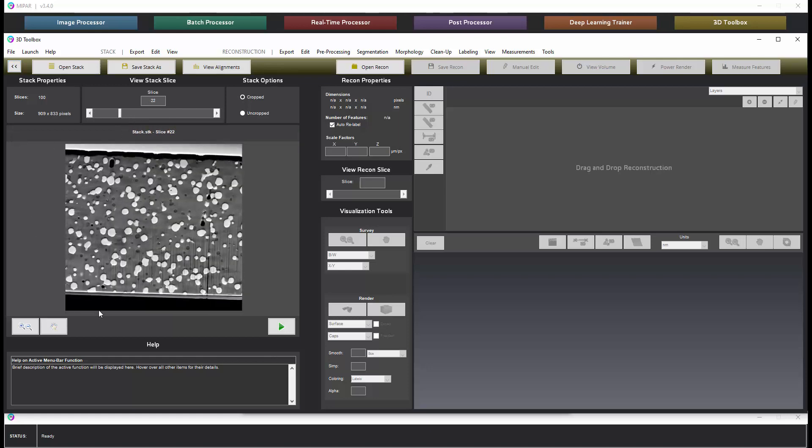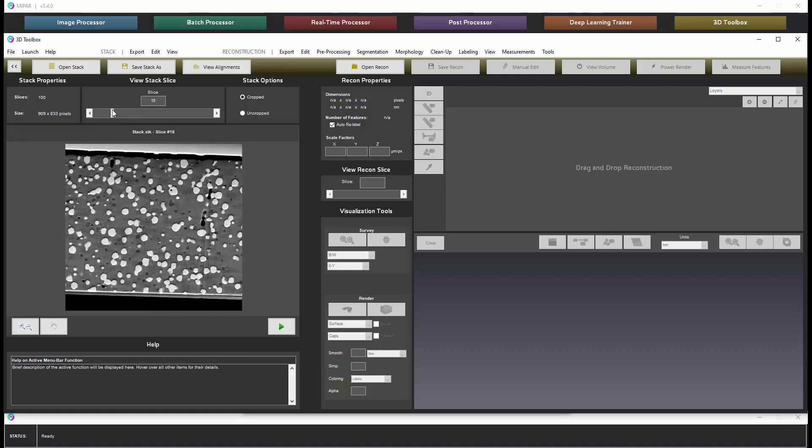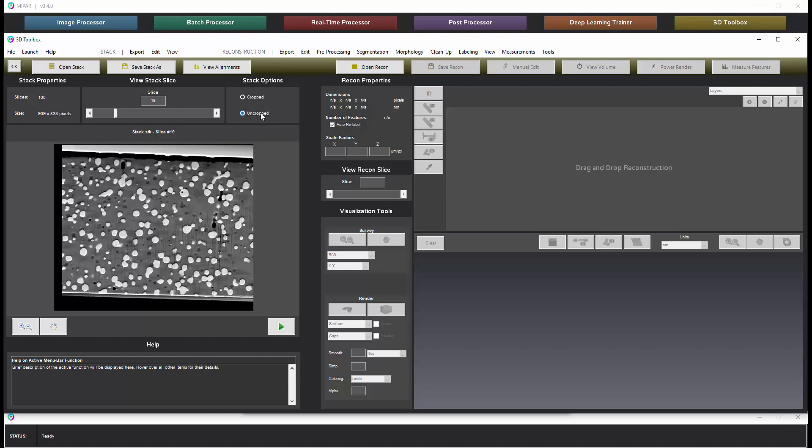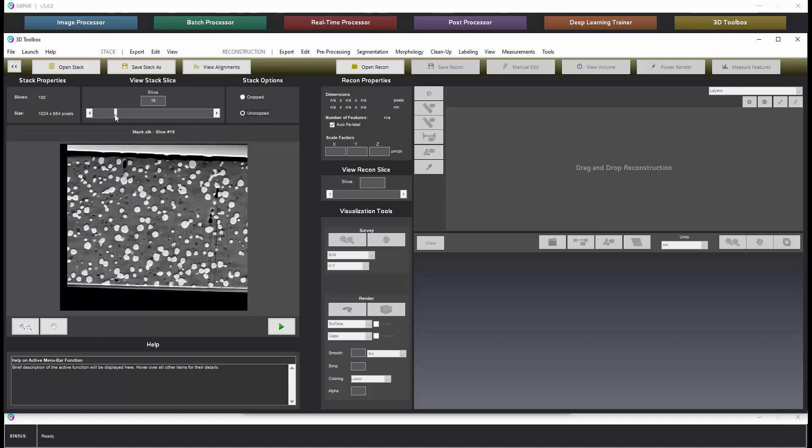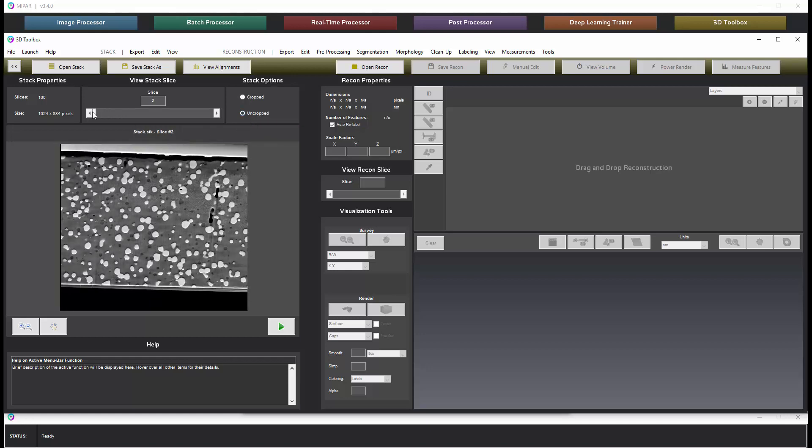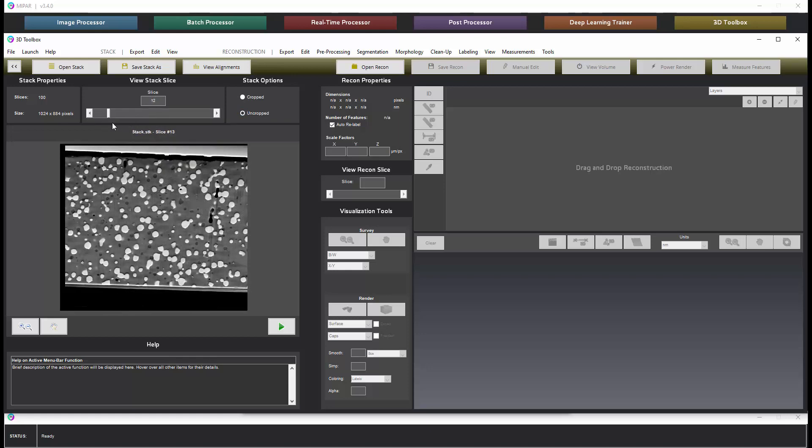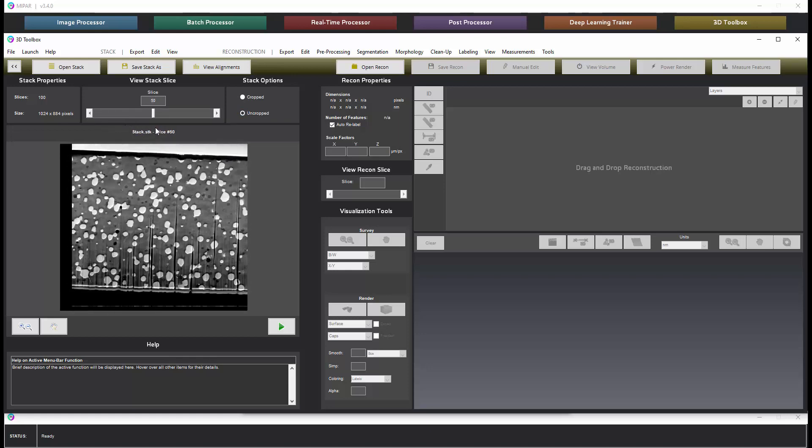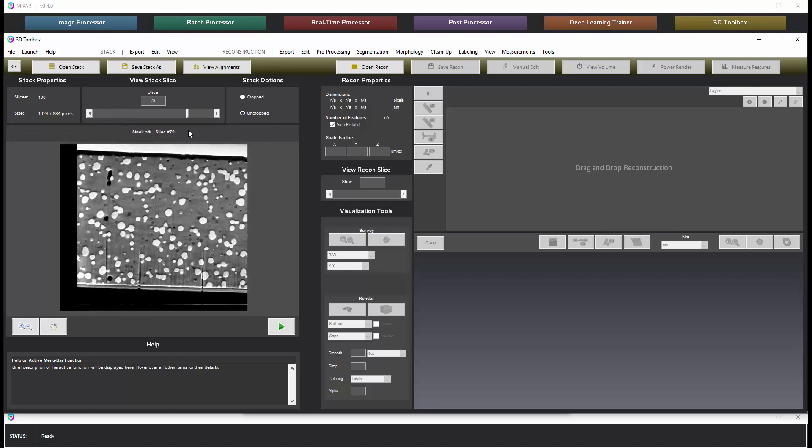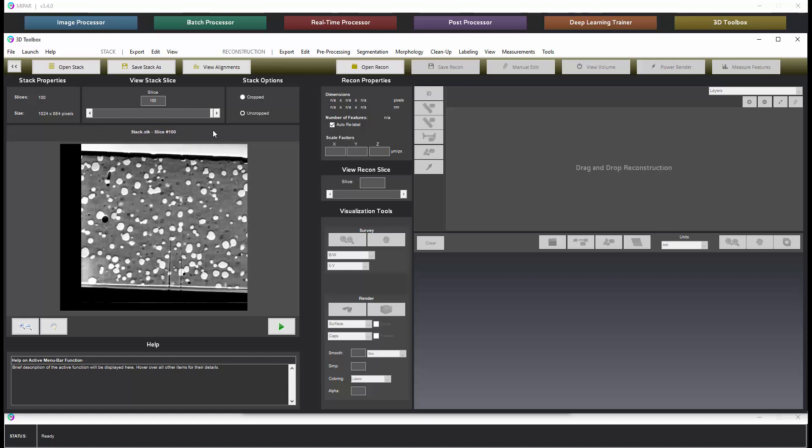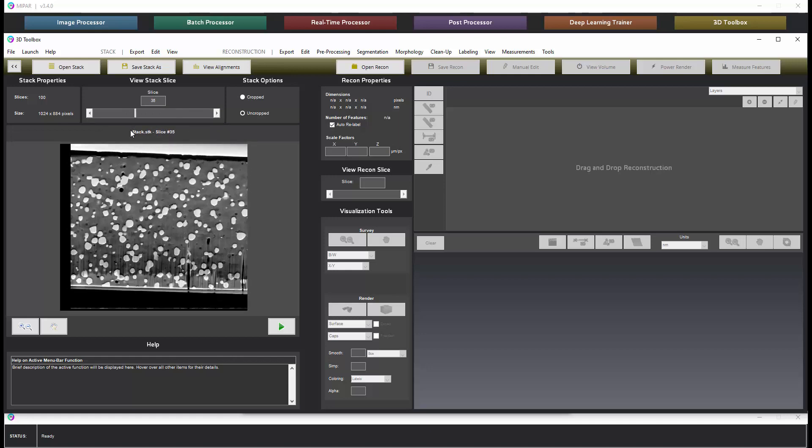This is the mutually aligned volume so it has been pre-cropped according to how much each slice had to shift. If we want to see how much each slice shifted we can expose the uncropped view and here we can see the black edging indicating how much each slice had to shift for the data to become aligned.